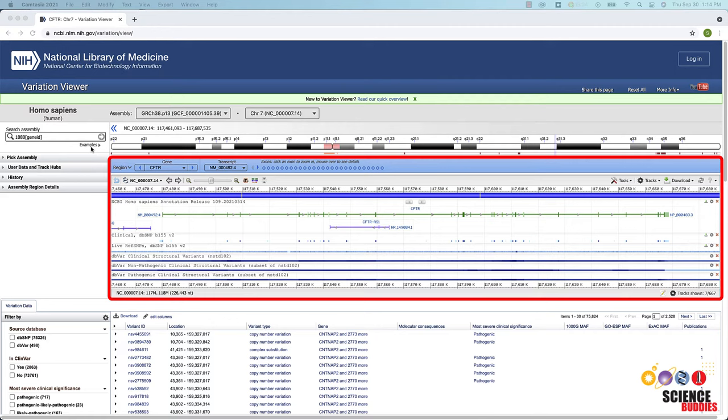You can also find the number of publications associated with the variant and links to those publications. If you want to find out more about a specific variant, click on the small arrow next to the Variant ID. In the drop-down section, you can find information about the transcript change that is present in the variant and its resulting change within the protein. In this variant, for example, the nucleotide in location 1, an adenine, has changed to a guanine. This results in an amino acid change from methionine to valine. Clicking on the Variant ID brings you to the reference SNP report for that variant. In the Variant Details tab, in the Gene section, you can look up the base change for that variant in the amino acid codon column. This information should match the protein change you found in the Variation Viewer before. Below the Gene section, you will see a display of the genomic region, including all recorded SNPs for that section of the sequence. The blue bar shows the location of the mutated nucleotide for your selected variant.